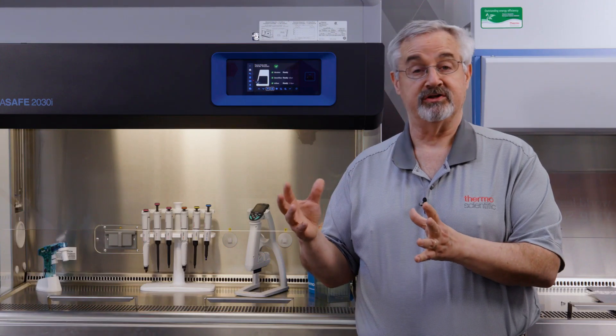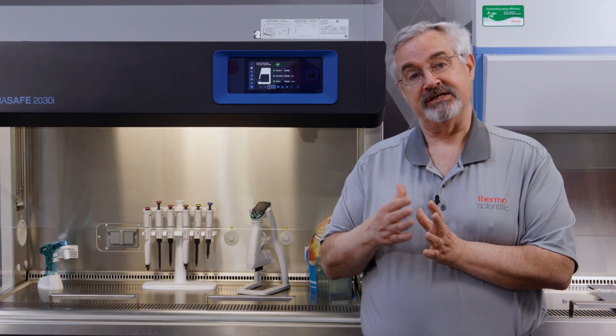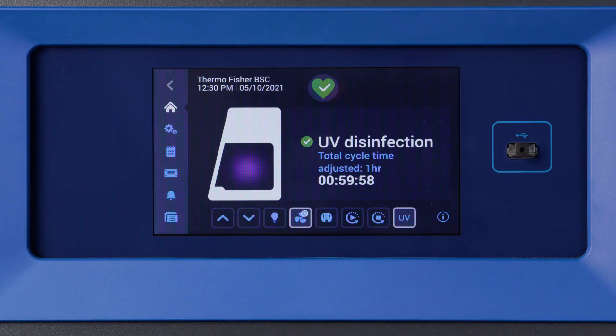The last containment feature I want to talk about is UV Plus. The germicidal effect of UV is a function of two things: the time of exposure and the intensity of exposure. Over the life of the UV bulb, the intensity actually decreases by 20%. Up to now, users have had to adjust the time themselves or set up an initial frequency assuming the loss. But with this cabinet, it will track the age of the bulb and automatically adjust the exposure time to maintain the same exposure dose as part of your disinfection cycle.